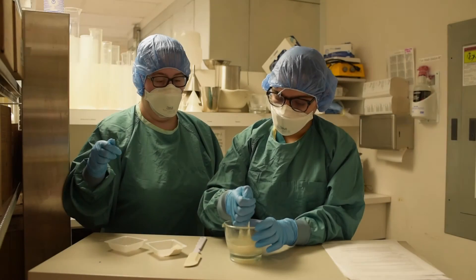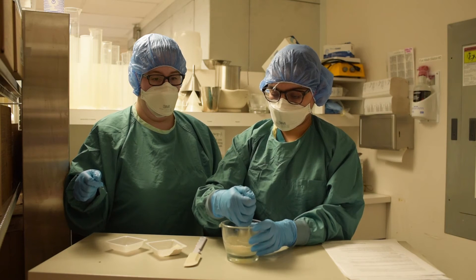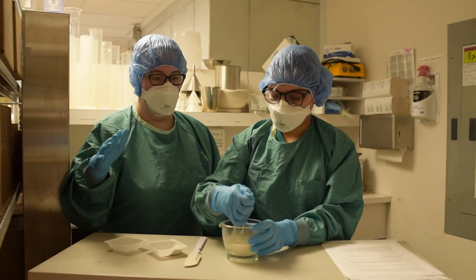In this scene, the technician is utilizing her scope of practice, providing supervision to a pharmacy student performing a restricted activity, such as compounding.